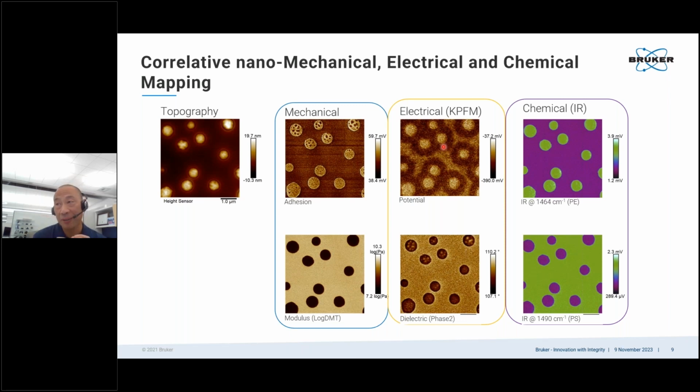I want to point out that what we are seeing here is not actually the work function of the polymer itself. It's actually the underlying silicon substrate, and the dipoles of the polymer modify the work function of the silicon a little bit, making it either higher or lower. So it tells some information about the bottom layer of the polymer.